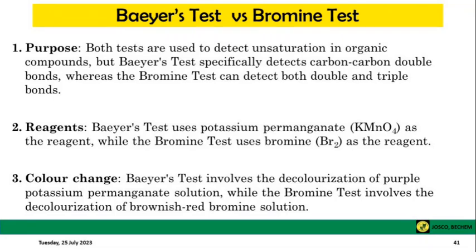Now, let us look at the two tests that we use to detect or identify the presence of unsaturated organic compounds. Are there similarities? Are there differences in how they operate or how the procedure is? Or even in terms of the reagents being used? What about the color change?